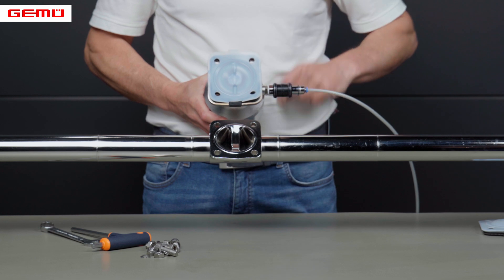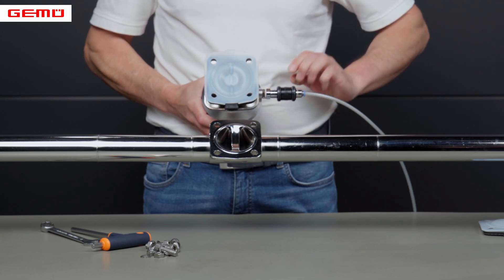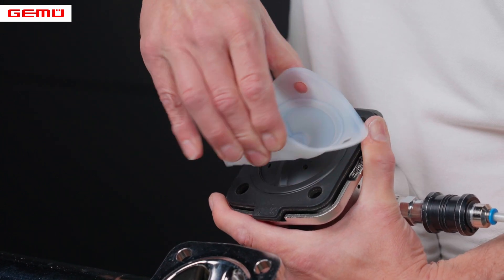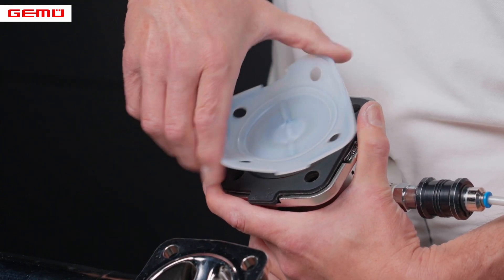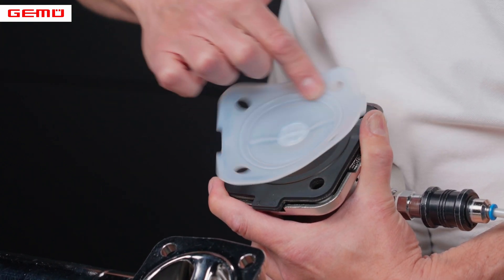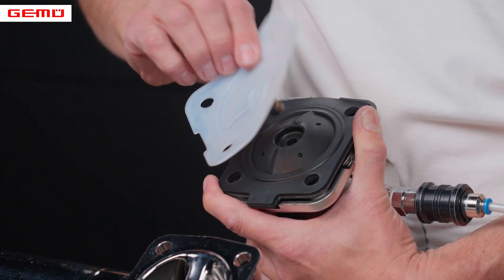The actuator is moved to the closed position. The PTFE face is inverted upwards by hand and unscrewed anti-clockwise. The EPDM backing diaphragm can then be removed.